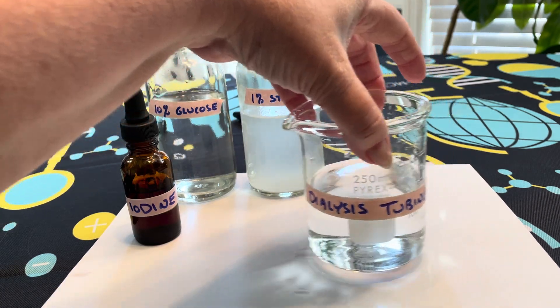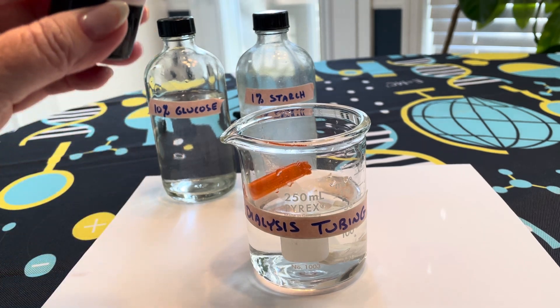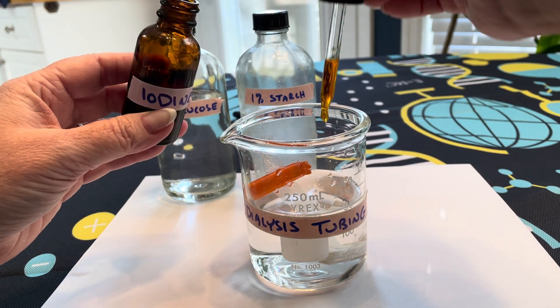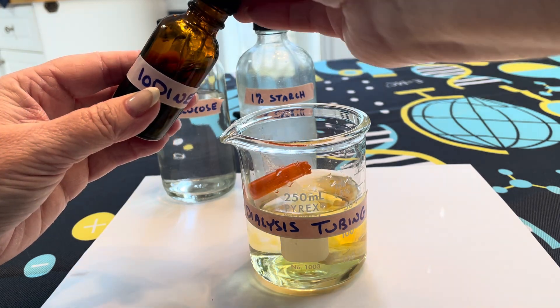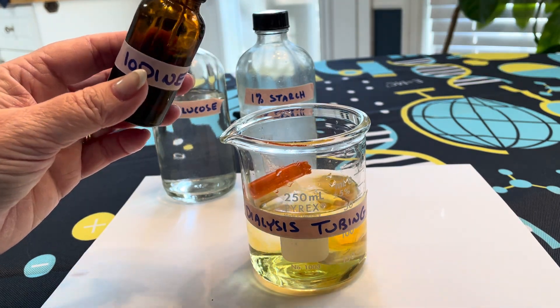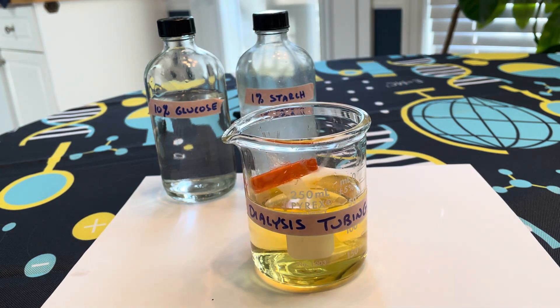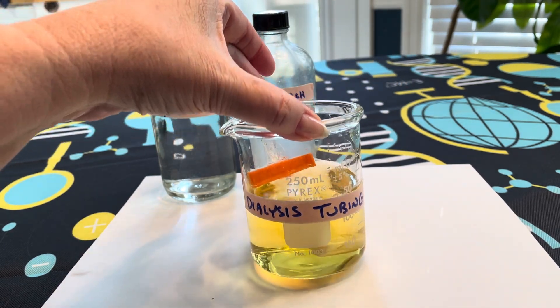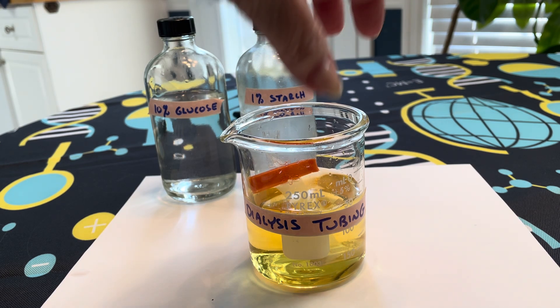We're going to put that into a beaker of water, and to that we're going to add some iodine. Iodine is kind of a yellowish or amber color stain. So when we pull this out of the bottle and mix a portion of it in, we see a yellowy color on the outside. We're going to let this sit for approximately 30 or 40 minutes and then come back to it.